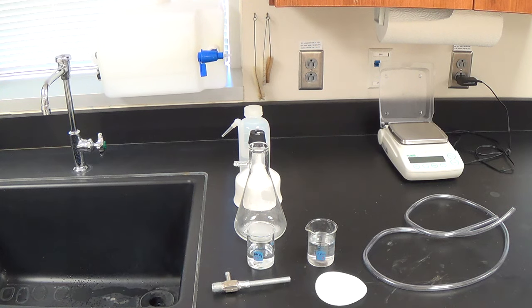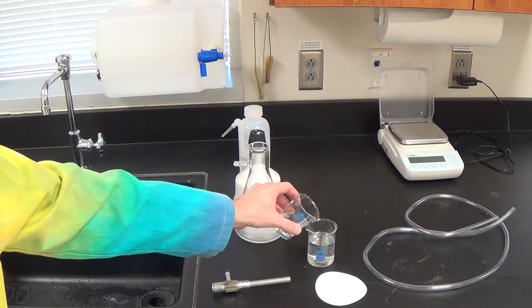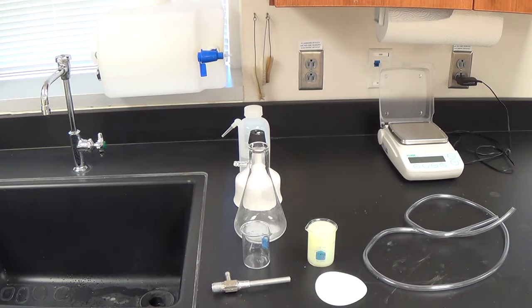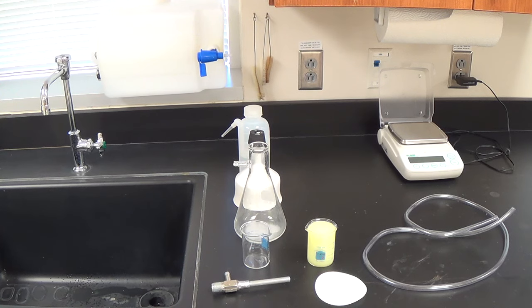For the sake of this video, I did a different compound, and so you will not get this yellowish compound. Yours will be completely white. But it does show up on video better to have a colored compound like this. So I have formed a precipitate.